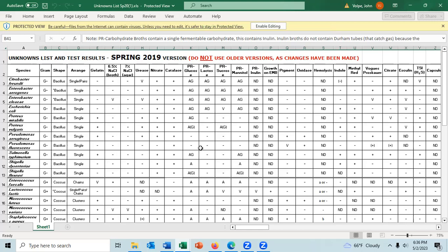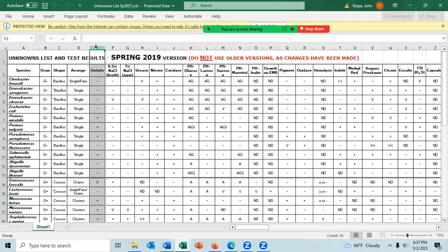But I'm going to try and send out the numbers tonight. I will pick the first 3 tests you're going to run. You're going to start the gelatin hydrolysis test maybe tonight. And there's the test results there. I'll explain what this is in a minute.